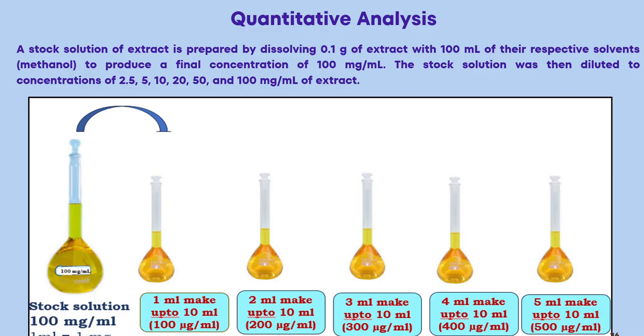Then prepare a suitable series of working concentrations and apply the different standard concentrations and sample solution as narrow bands on the same plate. Develop the plate using the optimized mobile phase under controlled conditions. Detect the marker compound at the optimized wavelength and after suitable derivatization.